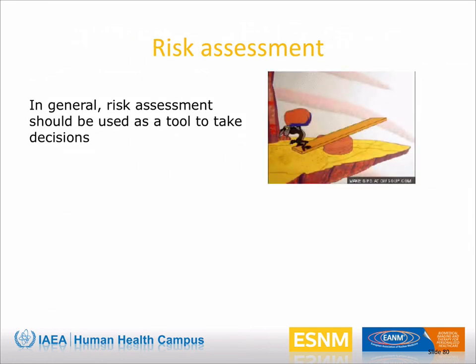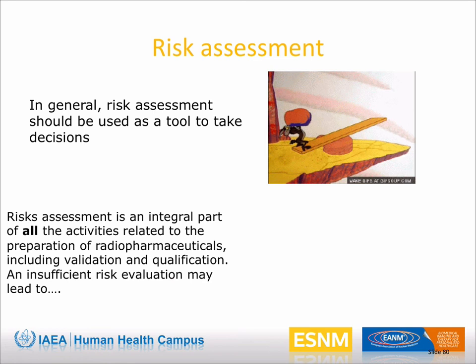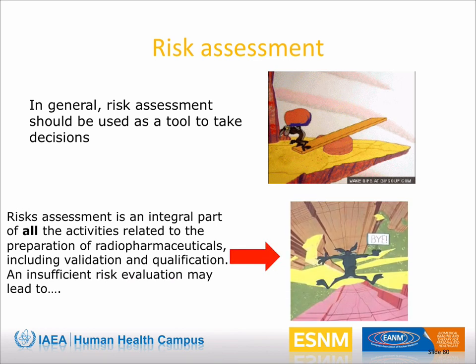Risk assessment is a useful tool that should be used to help operators and those responsible to take decisions. Risk assessment is even more important in case of radiopharmaceuticals, and it is indeed considered as an integral part of all the activities related to the preparation of radiopharmaceuticals, including validation and qualification. An insufficient risk evaluation may increase the probability of failure or of having problems.